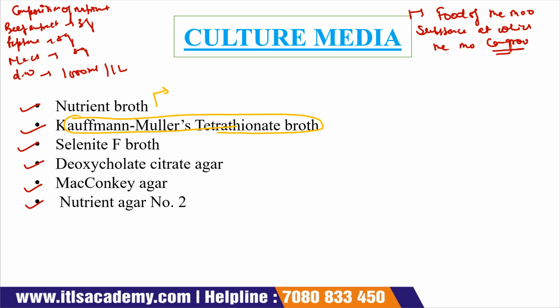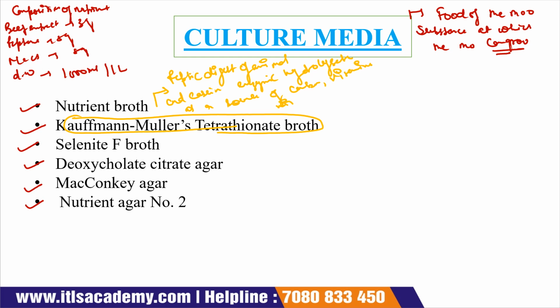It contains peptic digest of animal tissue and casein enzymic hydrolysate as a source of carbon, vitamins, nitrogen, and minerals.